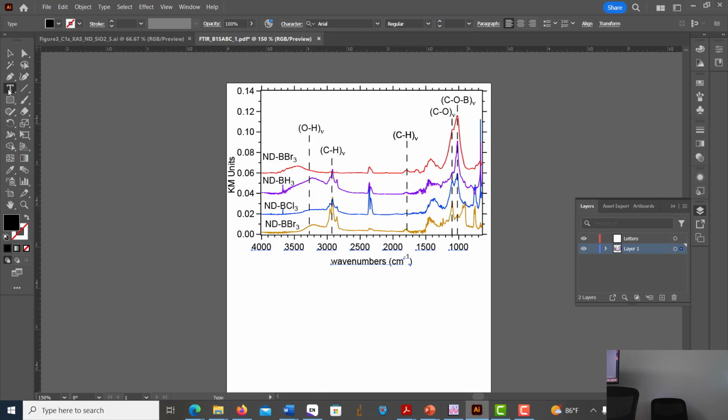They do come in once you've got the type tool. So you come on over here, you should be able to select, and then it should give you the actual size of the font, in this particular case, 7.976 point. We're going to put it at 9.